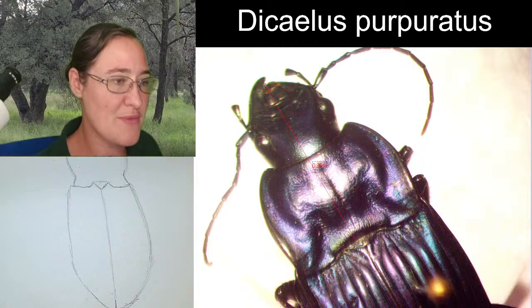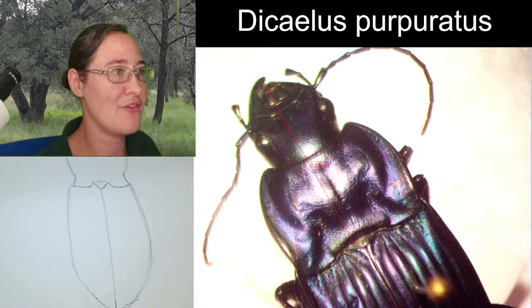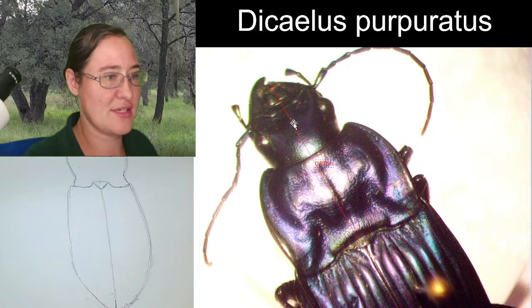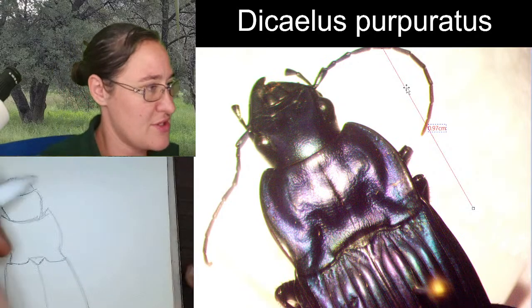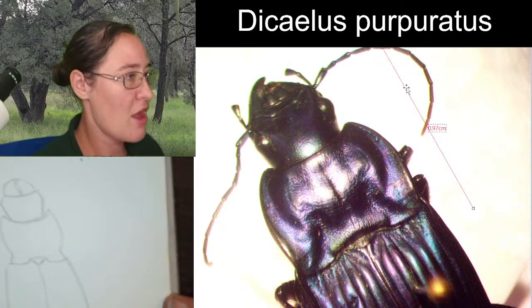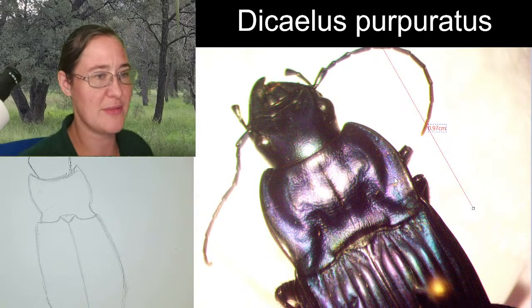So from the front of the head to the back of the pronotum, it is 0.97 centimeters, so almost a whole centimeter from the front of the head to the back of the pronotum.